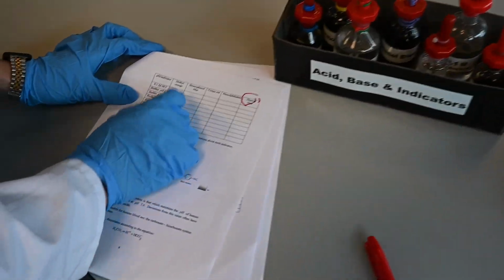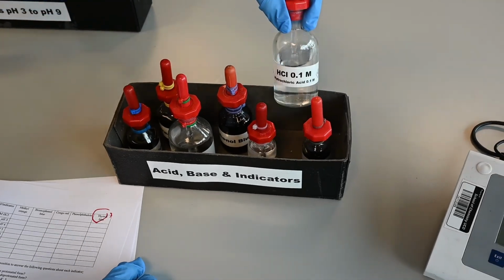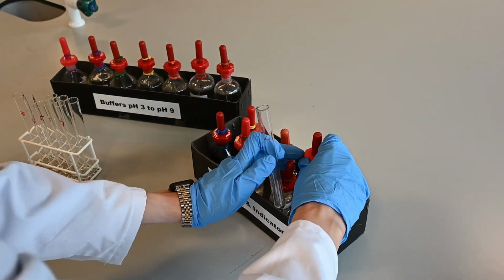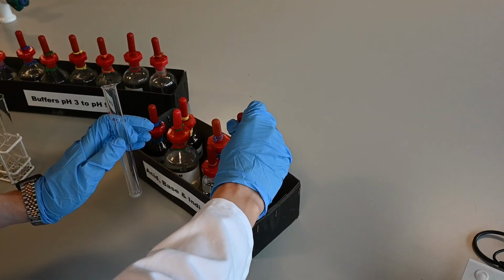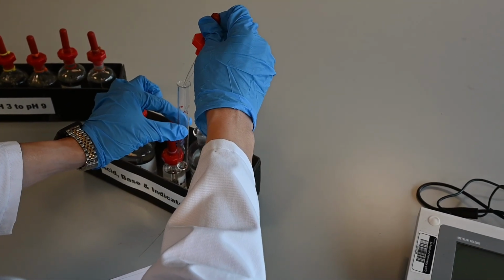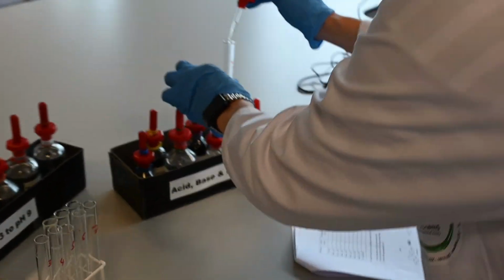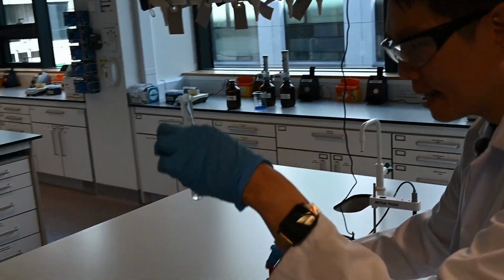So for the first case, you've got 0.1 molar HCl. Do we have it here? Oh, you do. This is a secondary container. Always keep it inside here. Then you just take the dropper, squeeze the rubber teat, make sure there's liquid there and it's not dripping, and then add. When you squeeze once, this is about a ml that you need. If you need a little bit more, just squeeze a bit more. Make sure your tip doesn't touch the test tube, no contamination. You see that? It's clear.